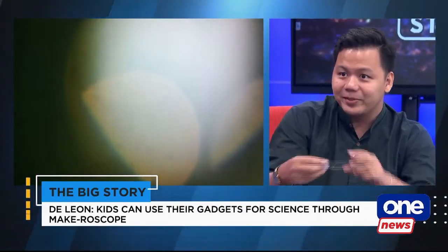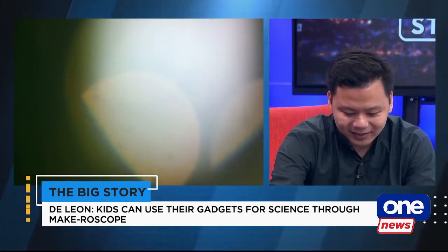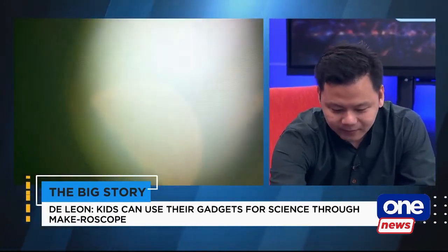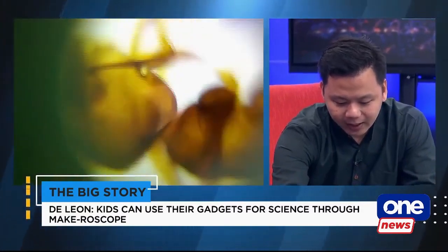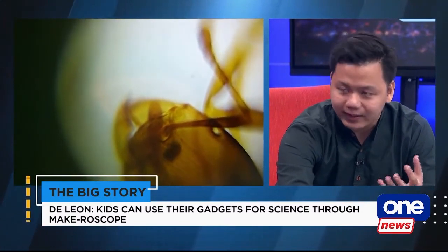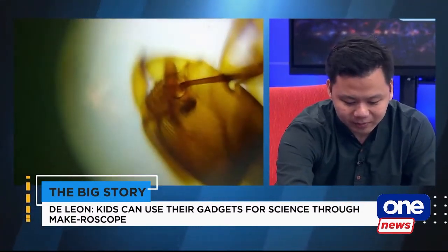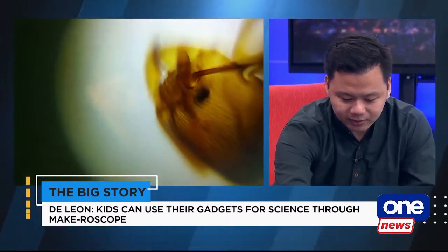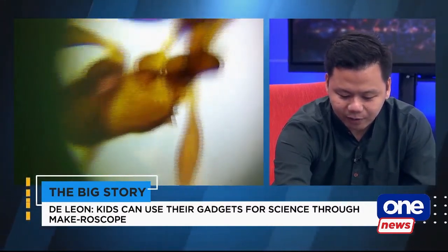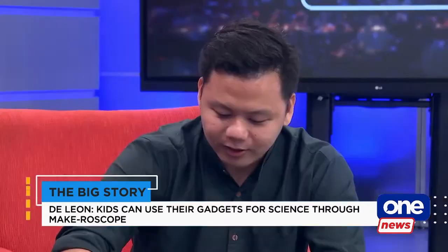We can see on our screens the live pictures from your tablet. Do you need that light? Do you advise that we use it with a little light? Better if there's an external light just to provide additional illumination. But clearly, we can see this ant. You can move freely, forward, backward.